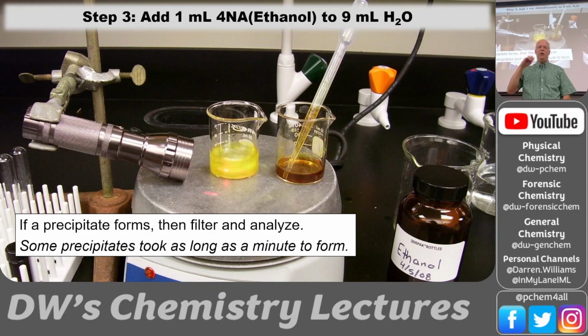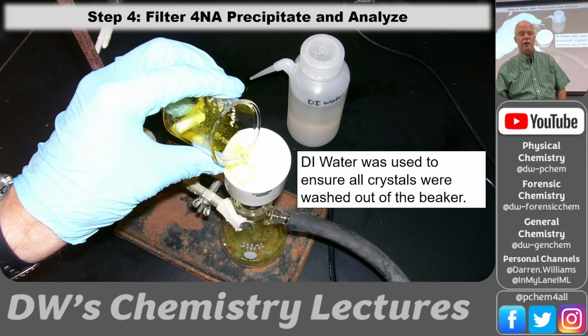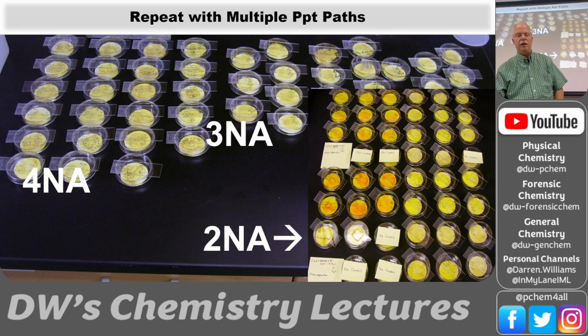So when we go into the non-solvent, we didn't see a lot of particles. And so we stabilized the nucleation, and we're letting growth happen. We're spinning the stir bar, and we take a mil of that, put it into water, big crash. We have lots of powder then. And then we filtered it. So Buchner funnel, filtered the particles, washed it out with water to get it all through. And the students did great work. It's a lot of tedious work.